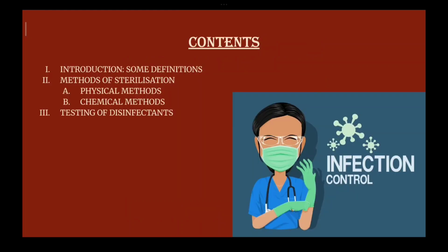The contents that will be covered in the sterilization series are the introduction, which involves certain definitions related to disinfection and sterilization, and the methods of sterilization, which are in the form of physical or chemical methods used in clinical and laboratory applications. Then we'll be studying the testing of disinfectants as well.